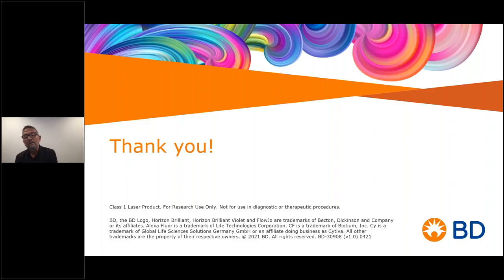Very good. A question came in here from a different angle, an angle of quality control. So what you've shown and developed here gives us finer detailed and better information, right? Or more defined information in terms of understanding spill and spread in your panel.